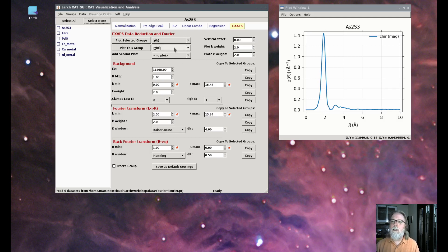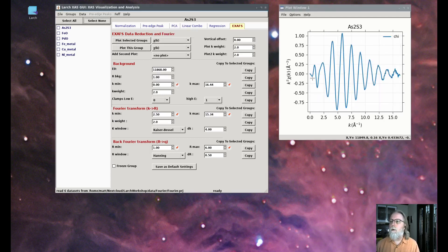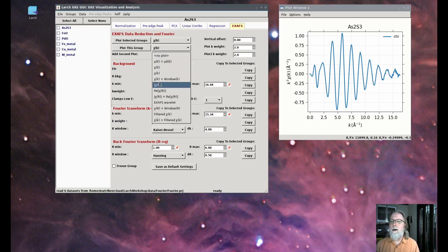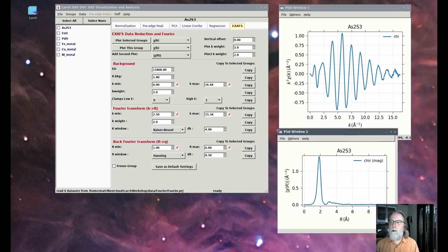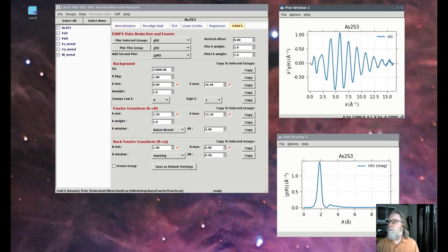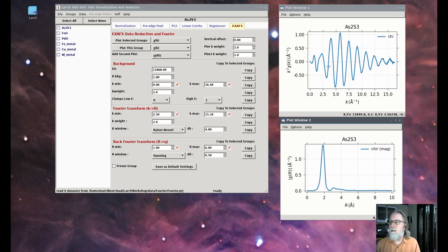That shows a single frequency, a single bond distance, a single neighbor at a single distance. These are really common plots to see in the literature for extended XAFS data — some k-weighting of chi of k, and the Fourier transform shown as the magnitude. The Fourier transform is a complex mapping of frequencies — a frequency distribution. So you could count how long a period is, and that's here at two angstroms.